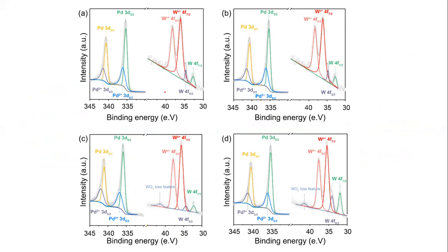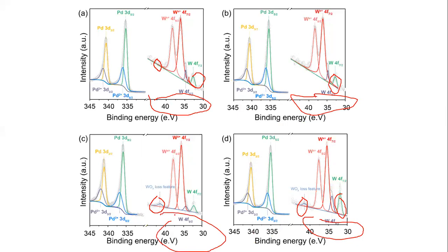And these are also, you can see here that there is no peak in this range, from 40, before, after 40. But here you can see after 40, you observe a peak over there. And here, you can also observe a peak over here. Also, the position, and here there is a peak, you can see a green is common here. It's also common here, and it's also common here. You can easily understand that from 40 to 30, that's a similar thing. But still there are some changes.